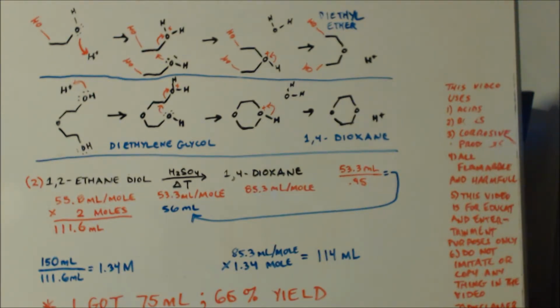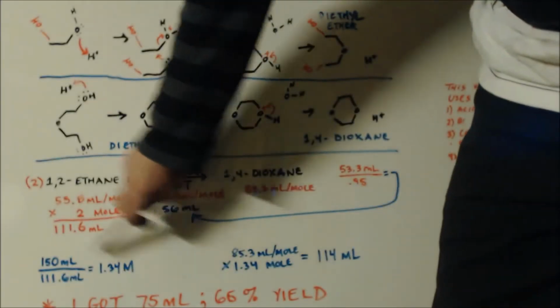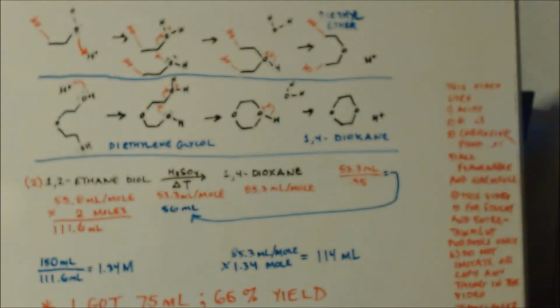I used 150 milliliters. There was a reason why I used an oddball amount like that. You know, I like to use molar amounts or fractions of molar amounts. That's all I had, and my source broke down and I can't go get any more. So I was like, I got this little cup full, I might as well just do something with it. So that is 1.34 times the amount that we needed for this equation, right? 1.34 times 111 gives you 150 milliliters.